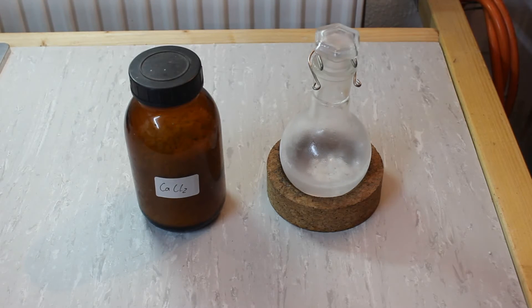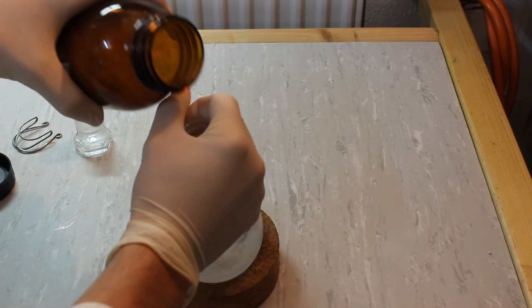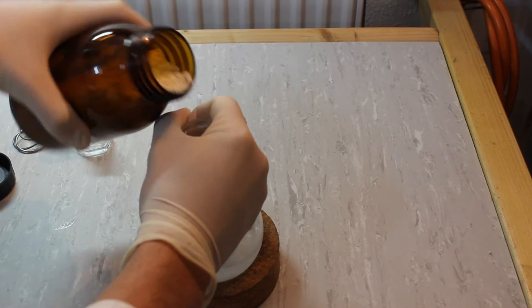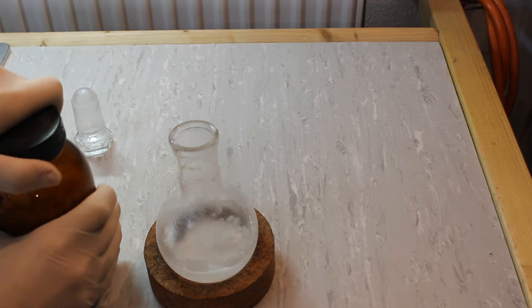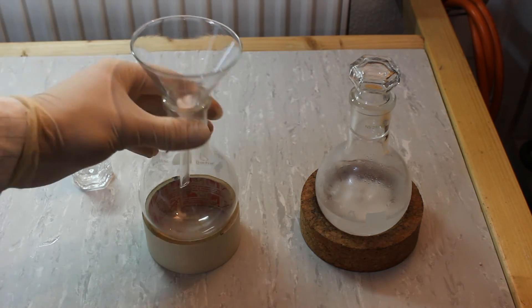The ethyl bromide was stored in the freezer over some calcium chloride. But to begin with, we add some fresh calcium chloride to remove any traces of ethanol or water that might still be present. The ethyl bromide has been sitting on top of the calcium chloride for about 30 minutes now, so I'm going to filter it through this cotton ball here into a different round bottom flask.